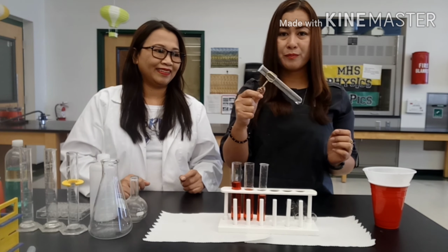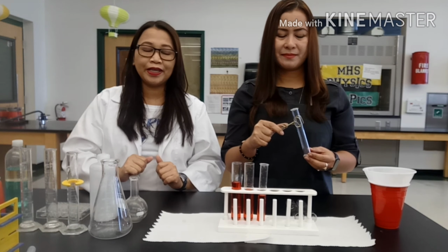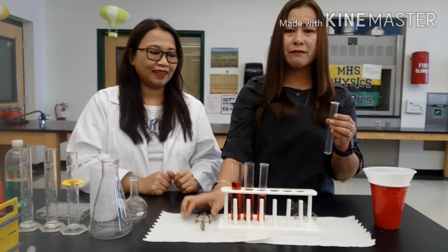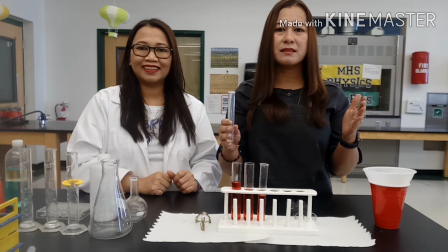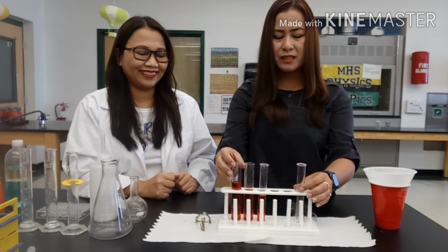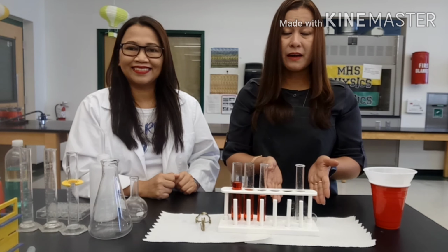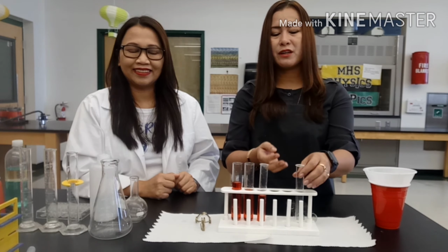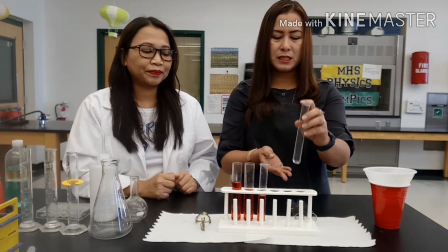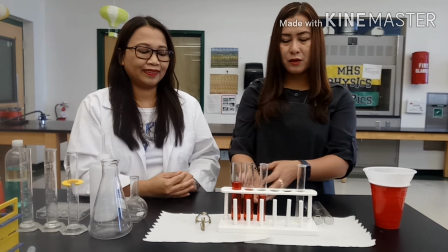If we're going to hold or mix liquids, of course we will be using the test tube. If we're going to use several test tubes, we will be using the test tube rack. Since the test tube is a very small container, it is used to store a small amount of your liquid, and to mix liquids too.